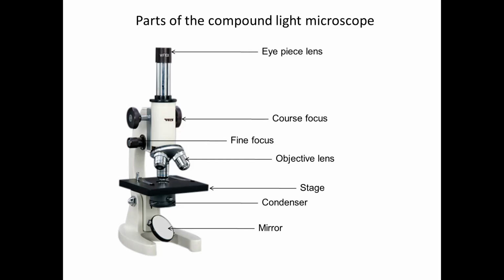You must always hold microscopes with both your hands by keeping one under the stage of the microscope and holding on to the part behind so that you don't damage the microscope.